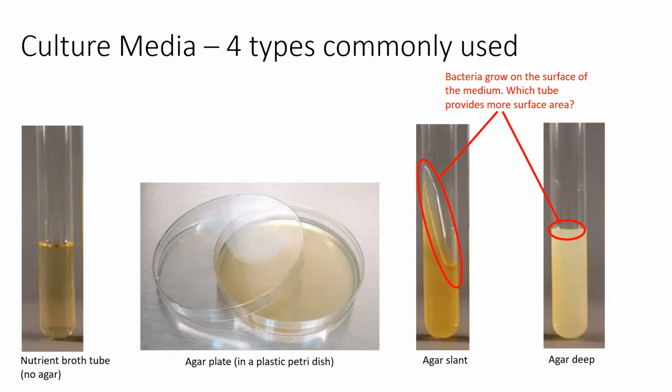But what happens is when we're making all of this media in the lab, we put all the different nutritional powders and things into a really large flask. We add water and we mix it all up. And then we add powder agar that is a powder. And again, we mix it all up and then we stick it in an autoclave. And let me go to that slide real quick. We'll come back to this one.